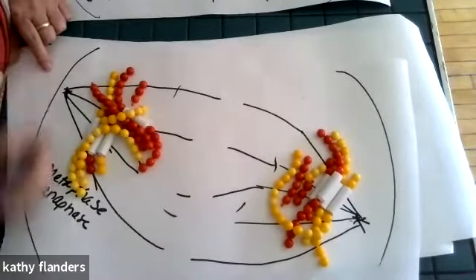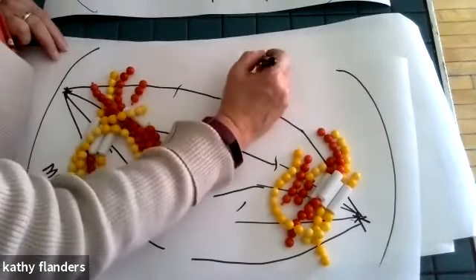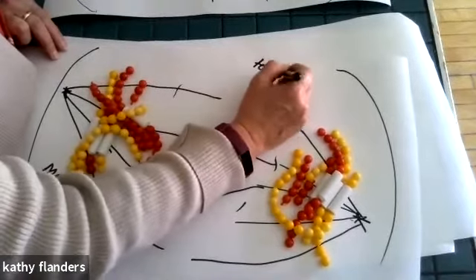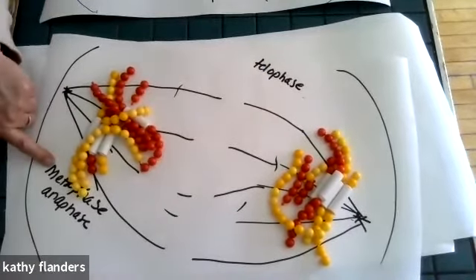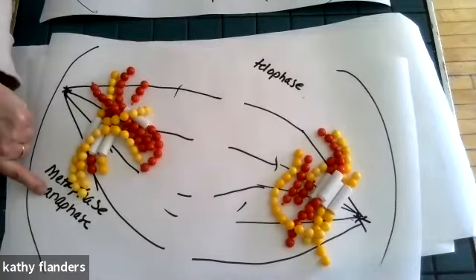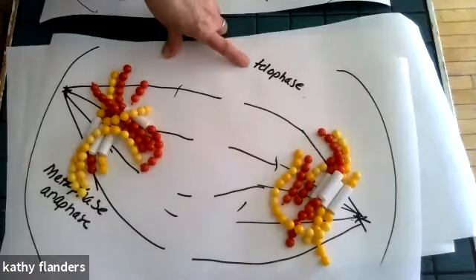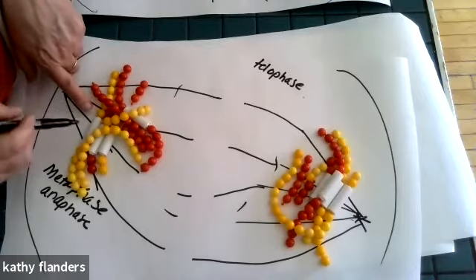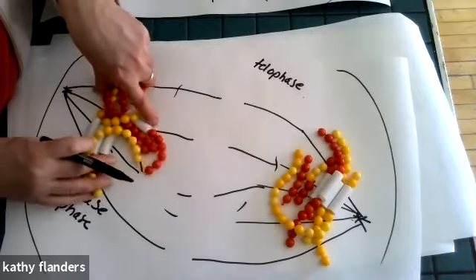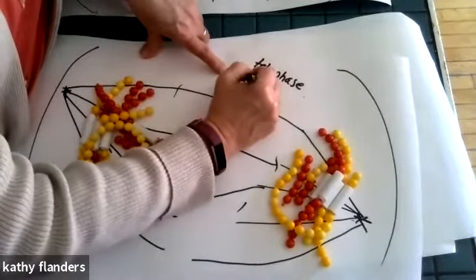All right, let's make a list for telophase, what we expect to see for telophase. So it goes prophase, metaphase, anaphase is when they're starting to separate. Telophase is going to be marked by several things. One is that the chromosomes are going to decondense. So we've got decondensing chromosomes.